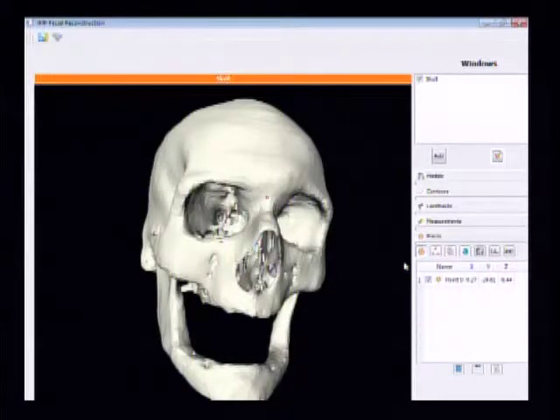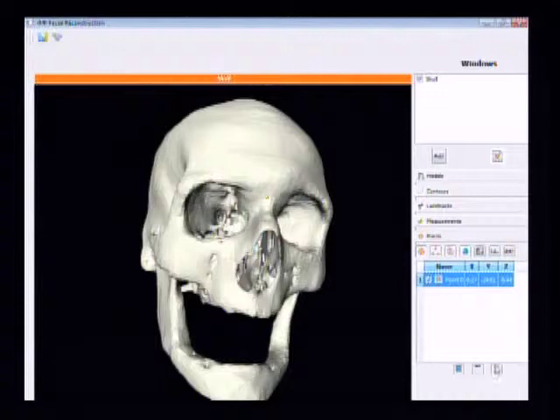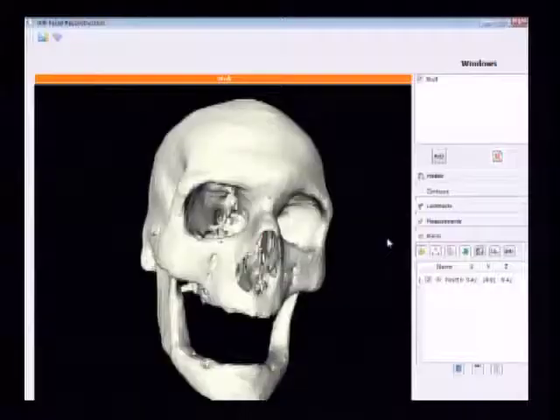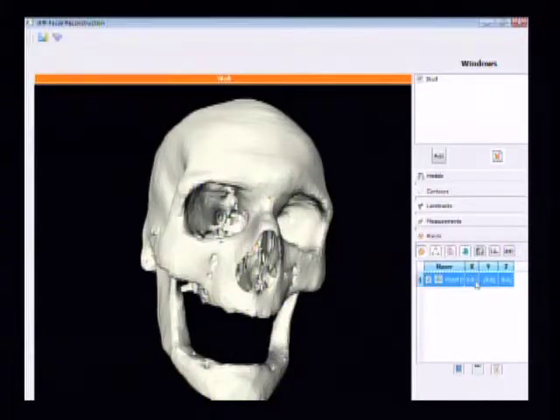So if you click on the area where the Asterion is, this takes a point. If you think it's wrong, you can select it, and it will be yellow, and just hit delete. Select it, it will be yellow, and then hit the delete button. And then you can go and select it again. So now we want to save this in the database as Asterion. So if you click on the table here, left click, and then right click, and then click Save to the database.